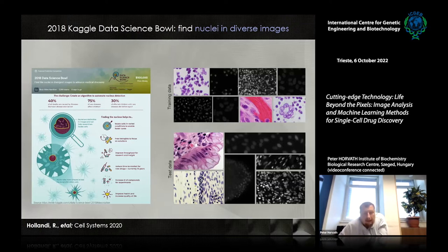So that's not that bad. It also turns out, and probably many of you know, that deep learning is super data hungry. So if you want to make an efficient deep learning method, you need a lot of data. For big providers like Facebook or Tesla, this is very accessible. For us, computational biologists, this is less. So we said that probably we could use another approach.